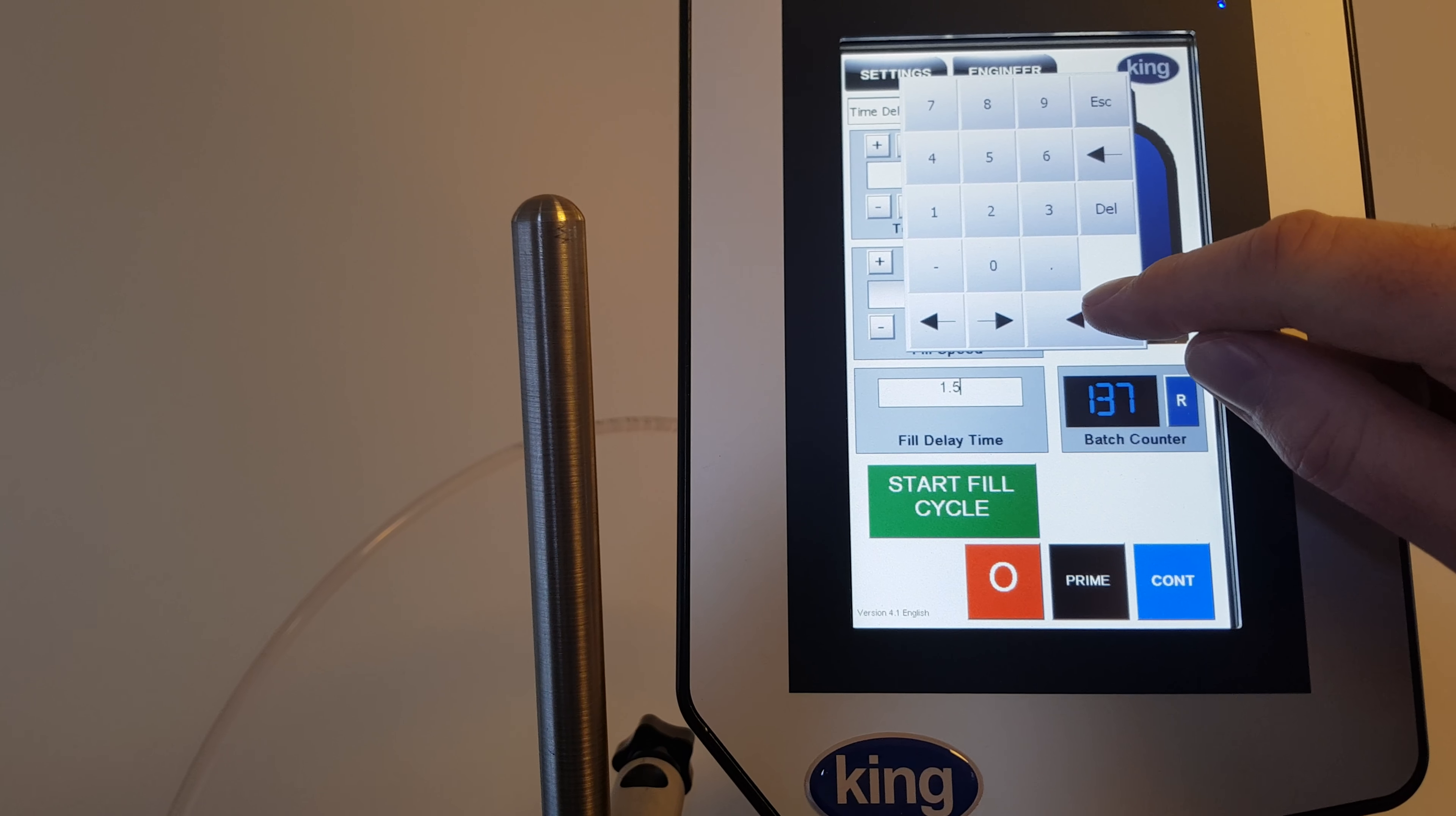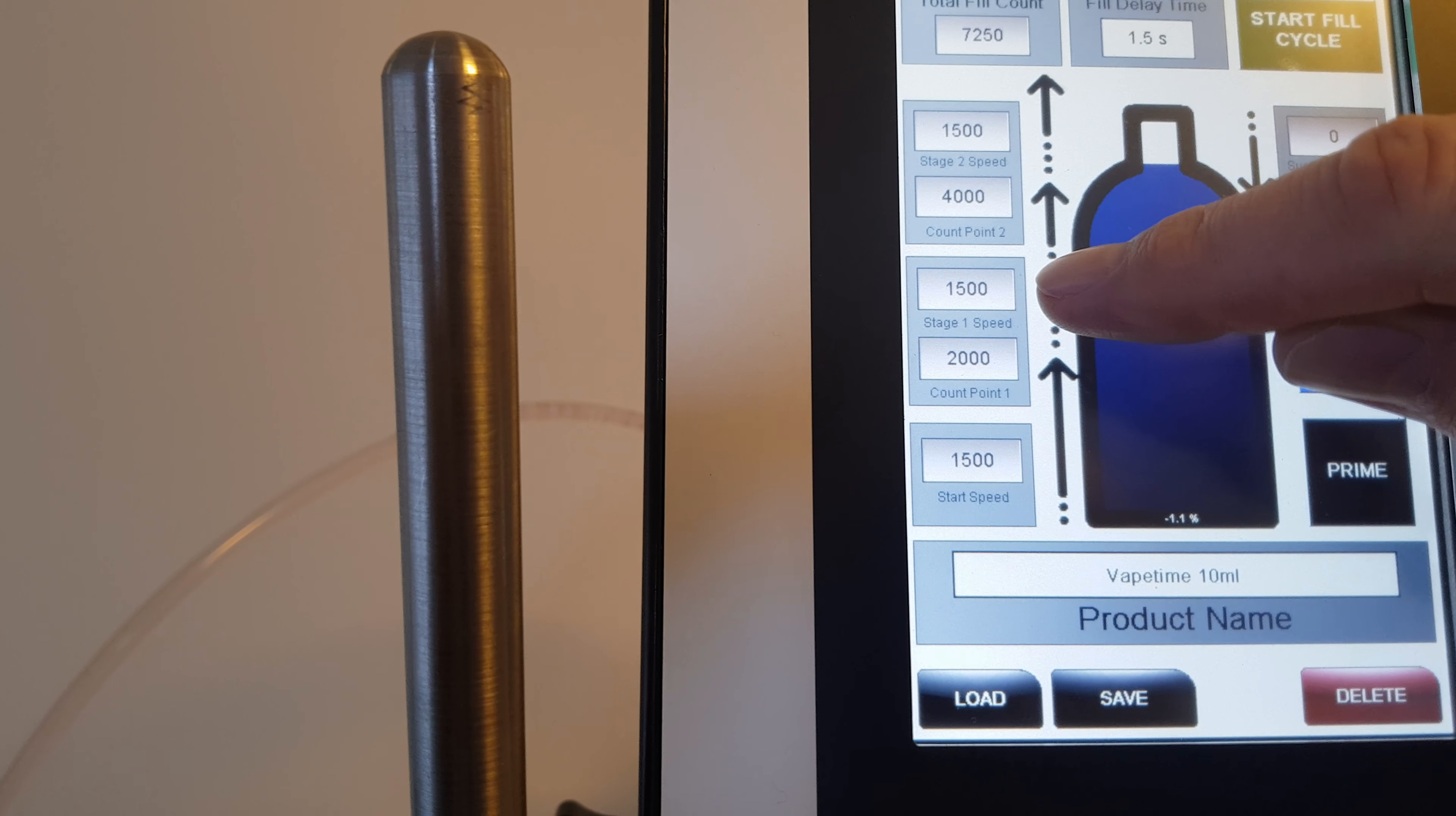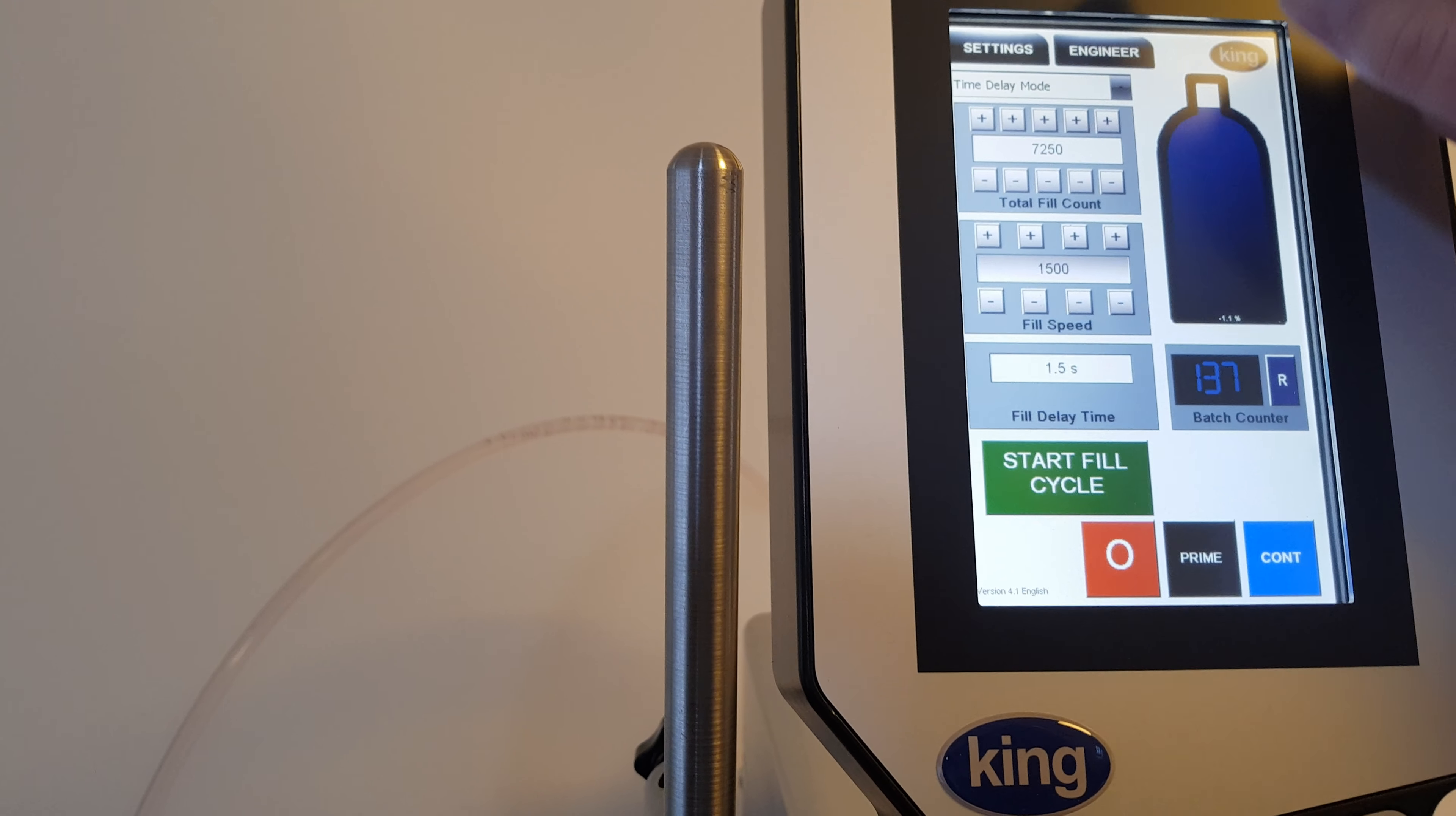That's now set. We look at settings, so it's going to have a start speed of 1500 RPM to a count point of 2000 and continue at 1500 RPM to count point of 4000. This is actually not profile filling, this is just filling continuously at 1500 RPM to that point. We know through testing that that fills that bottle at that speed.